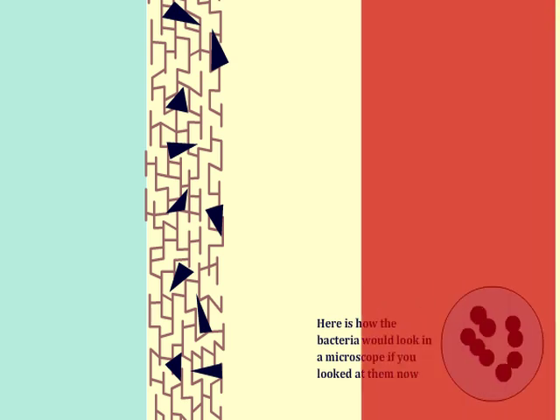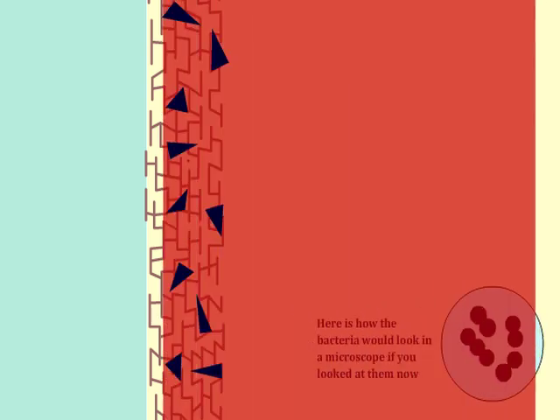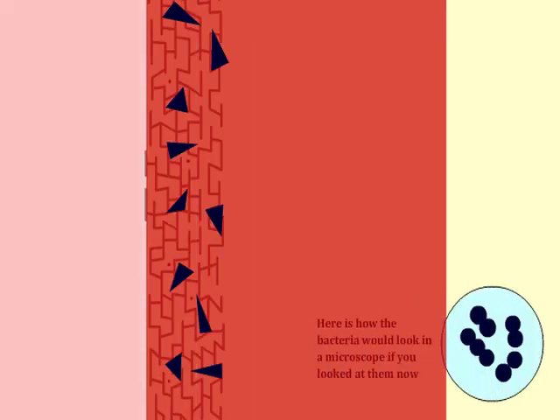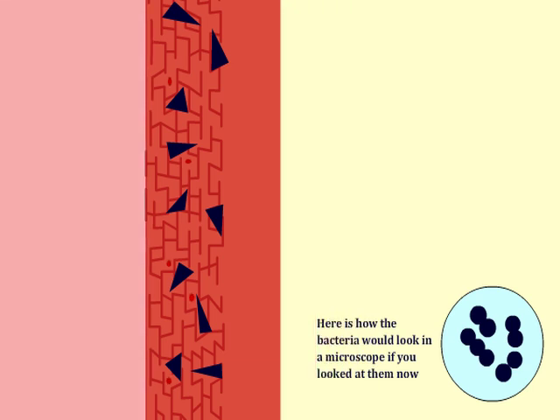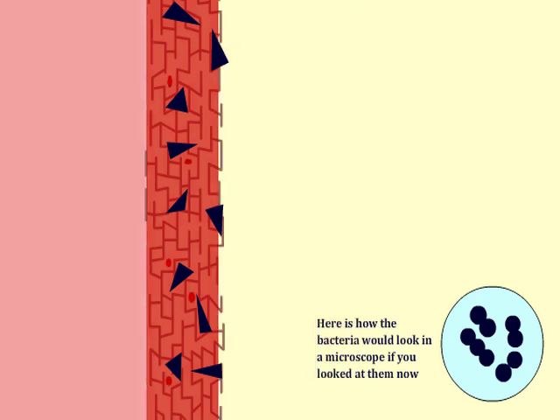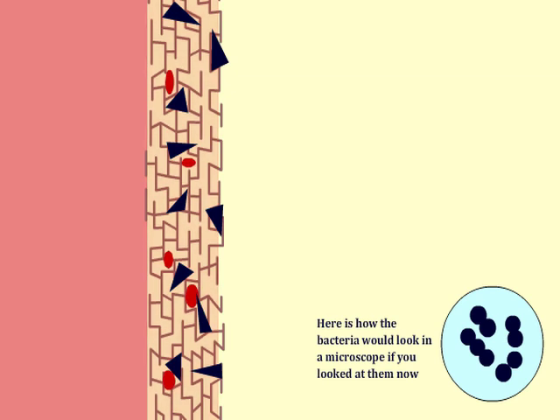Finally, the slide is counterstained with neutral red, or safranin, for one minute and then washed again. The red stain also confers color to the bacteria. However, the red color is not apparent because of the persistent dark blue stain that dominates the microscopic appearance of the bacteria.